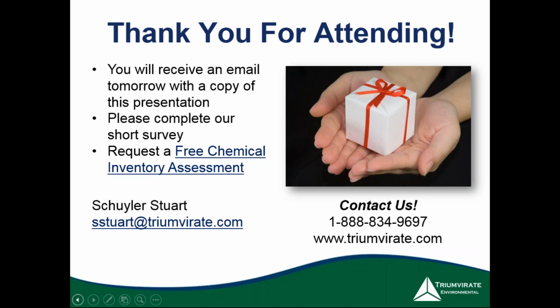If you have a robust Excel sheet, it can even help with this, calculating your flammable limits and stuff like that. But you can also track for high haz chemicals. You can track dates and stuff like that. Get a list of dates, but definitely the name, the catalog number if possible, the CAS number, the size, the quantity, and then where that chemical is in your facility as well.